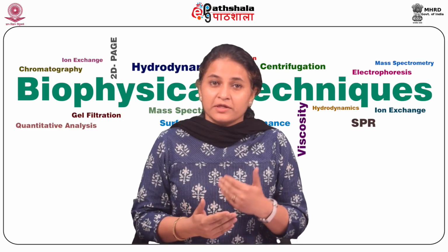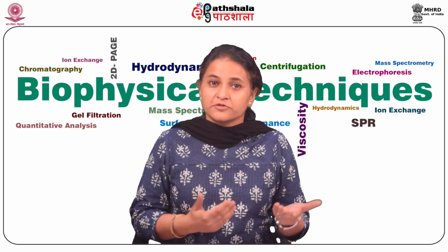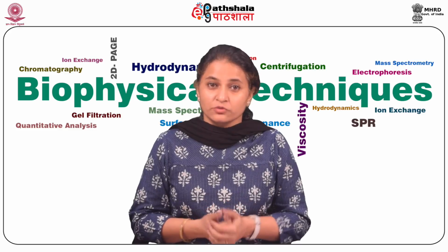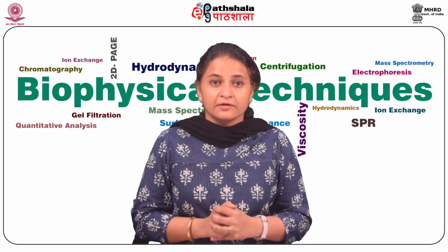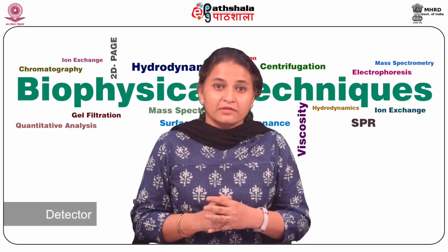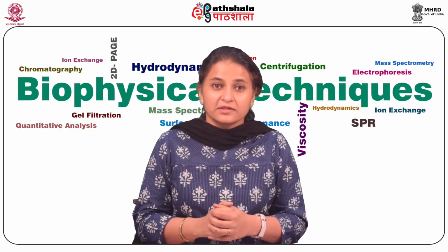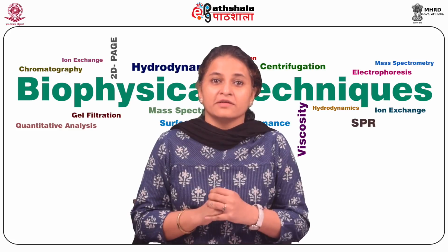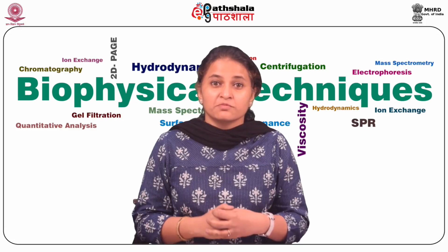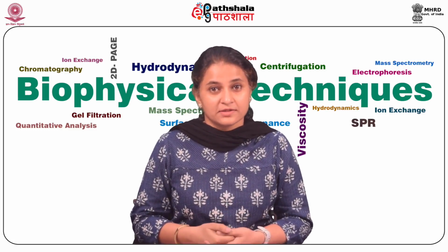The column may be of a packed type or a capillary type, and although packed columns were much more common earlier, now it is capillary columns that are the most frequently used. Then the final crucial element in the gas chromatographic system is the detector, and these are again of multiple types and of varying sensitivities. In fact, it is the wide range of detectors that are available to be attached to the gas chromatographic column system that has made this technique so versatile for analysis of all kinds.